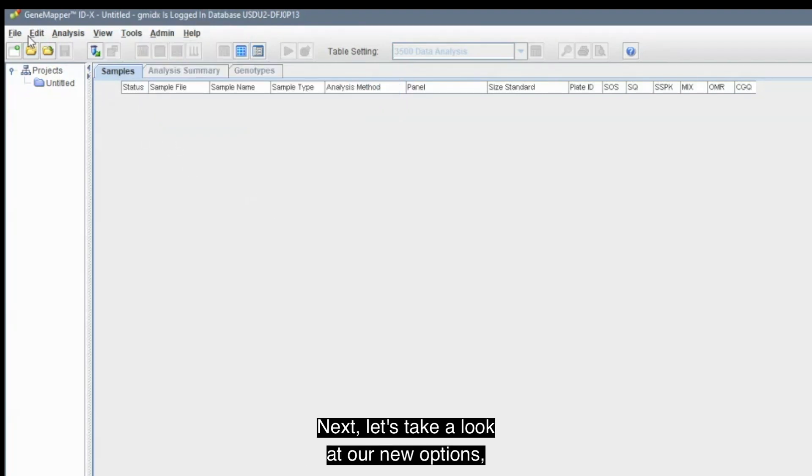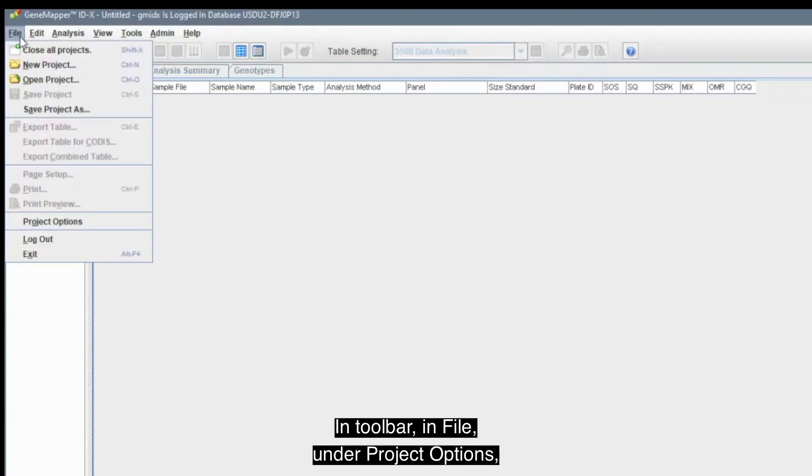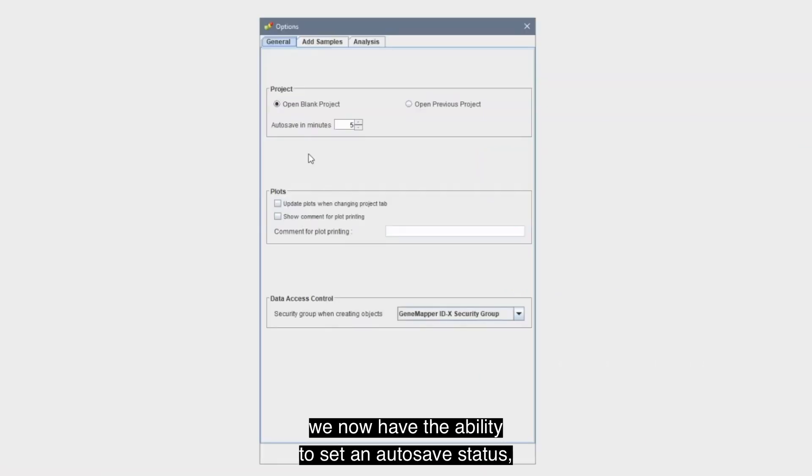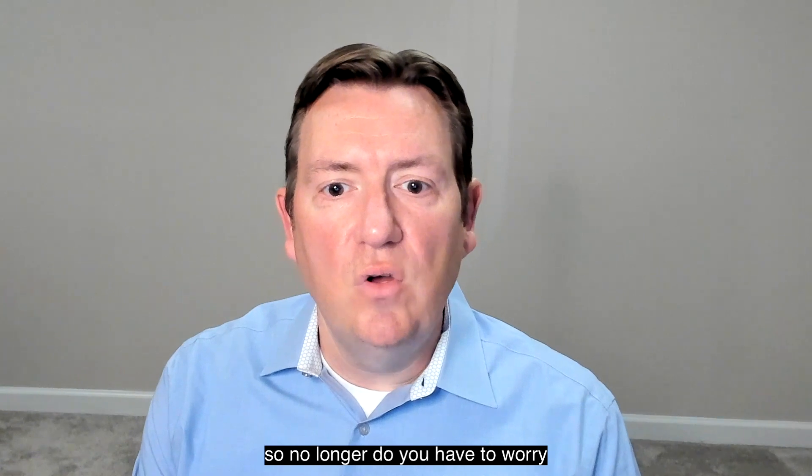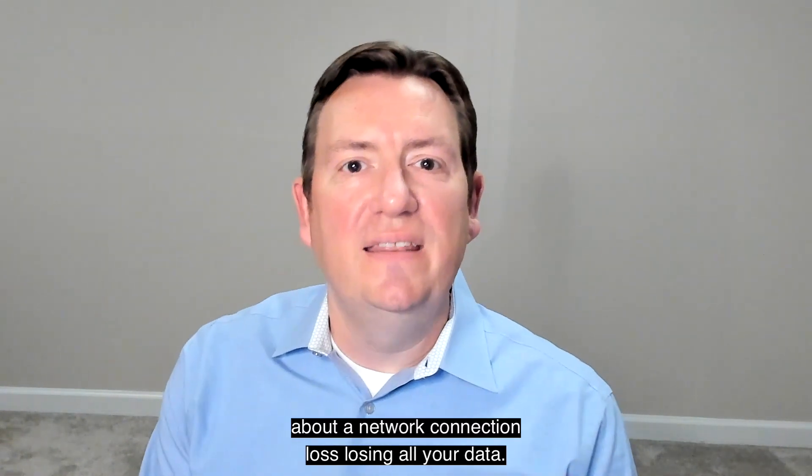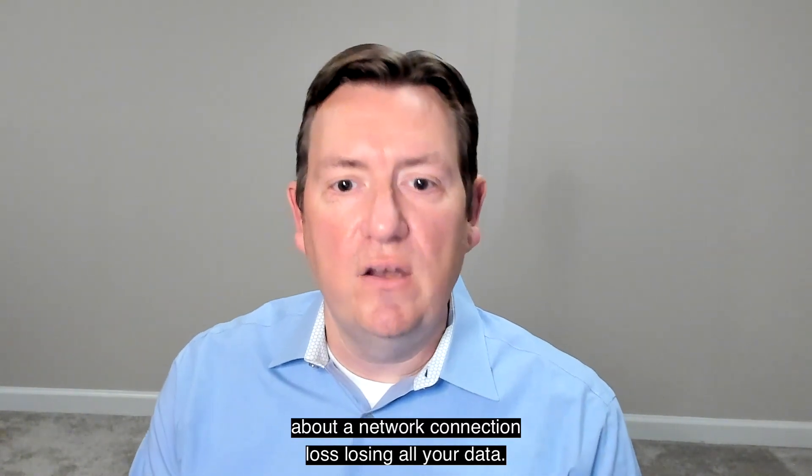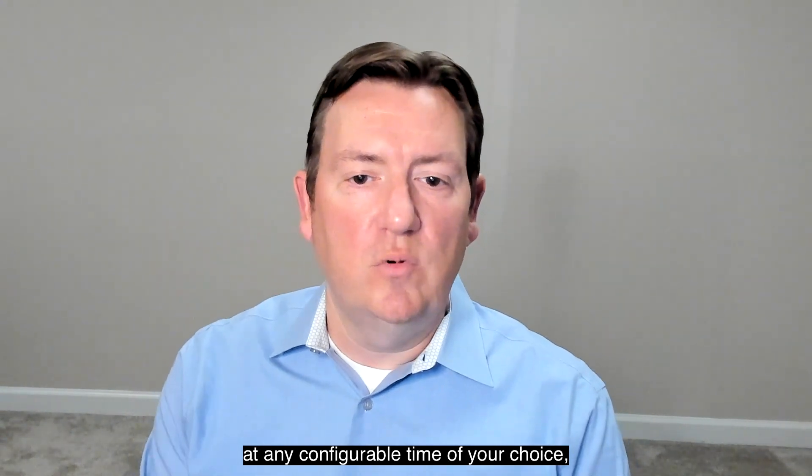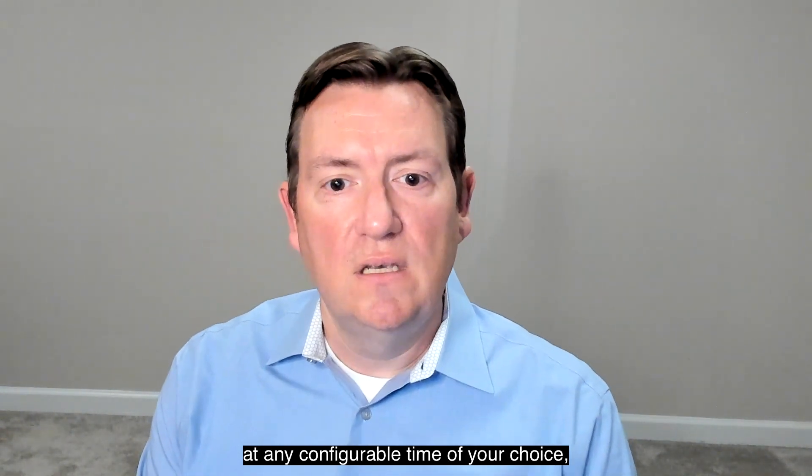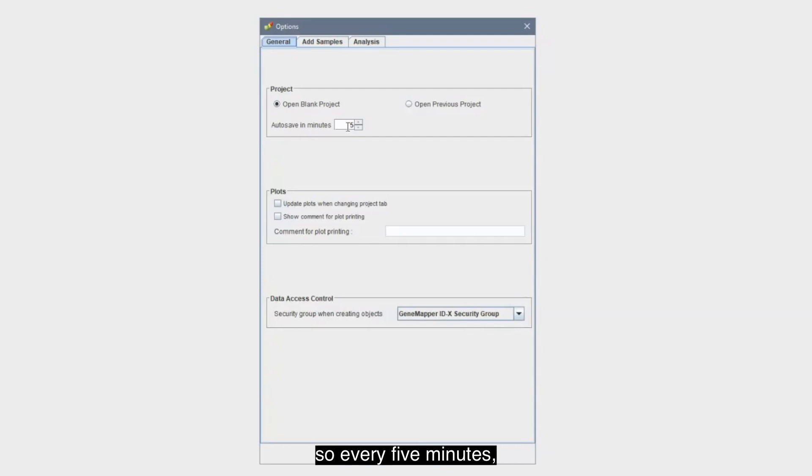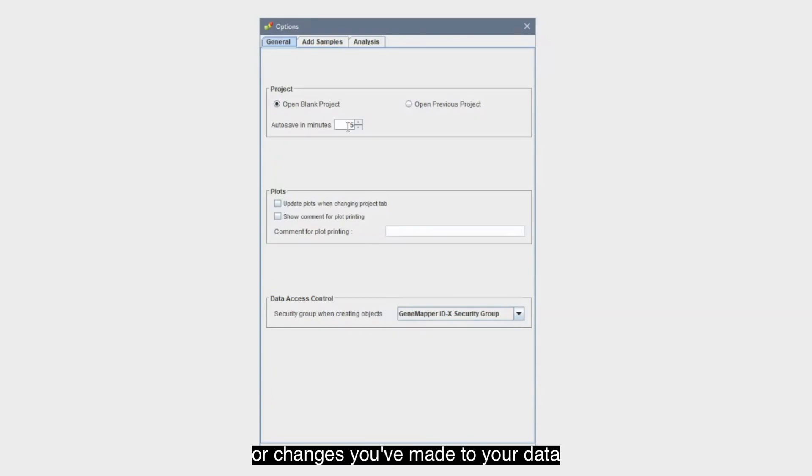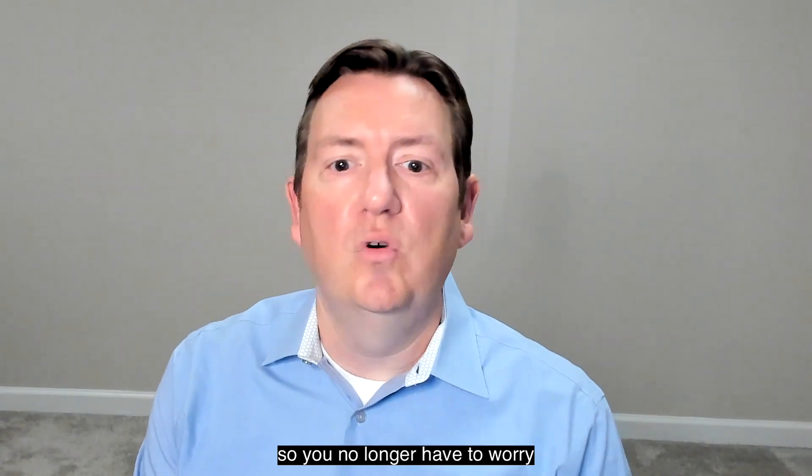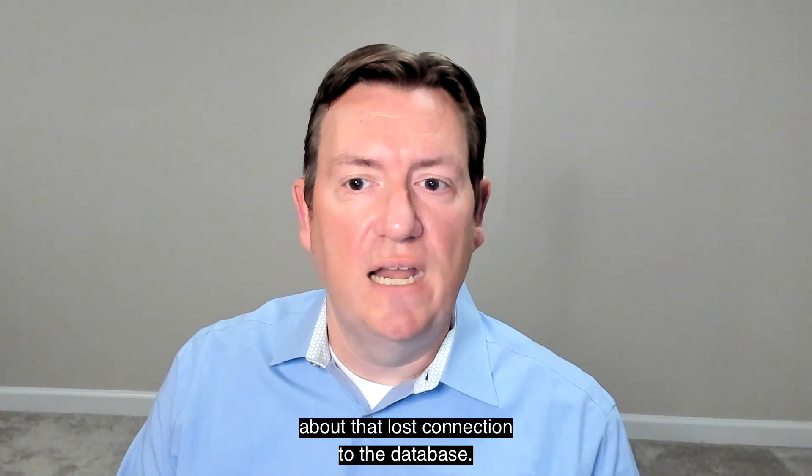Next, let's take a look at our new options, starting with the File menu. In Toolbar, in File, under Project Options, we now have the ability to set an Autosave status. So, no longer do you have to worry about a network connection loss losing all your data. Autosave runs in the background at any configurable time of your choice. Presently on my screen, I have it set at five minutes. So, every five minutes, any previous uncommitted comments or changes you've made to your data will be saved permanently.